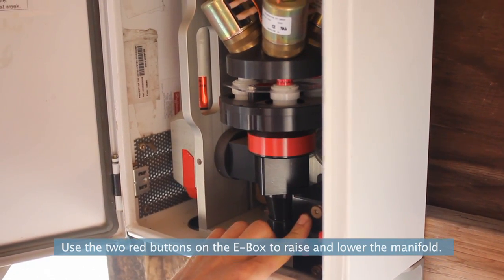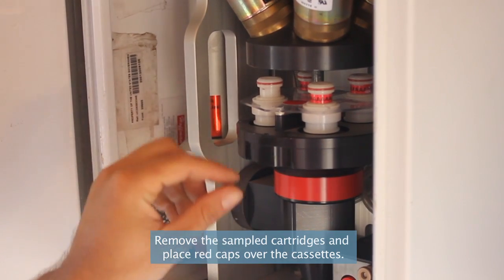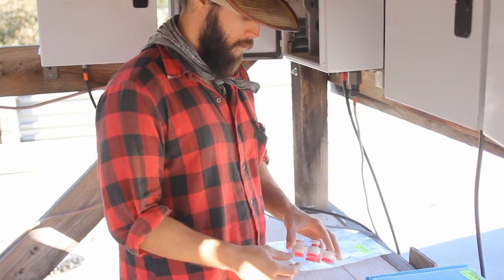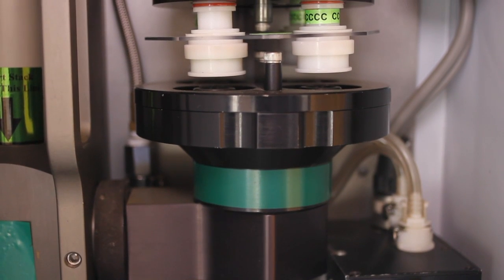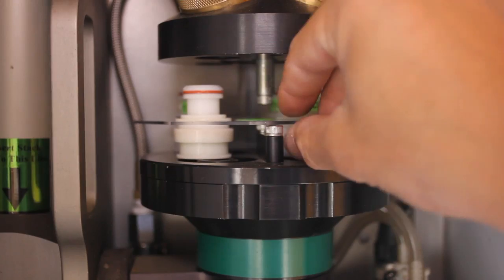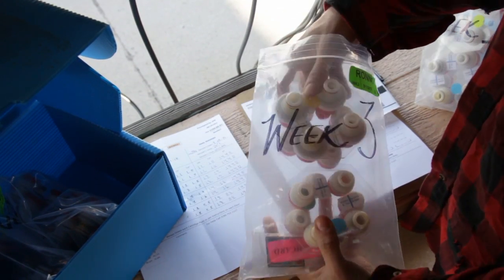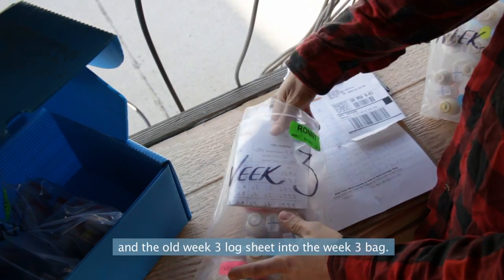Use the 2 red buttons on the e-box to raise and lower the manifold. Remove the sampled cartridges and place red caps over the cassettes. The red caps should be in the week 3 bag. Make sure all cartridges have red caps. Then place the cartridges, flash card, and the old week 3 log sheet into the week 3 bag.